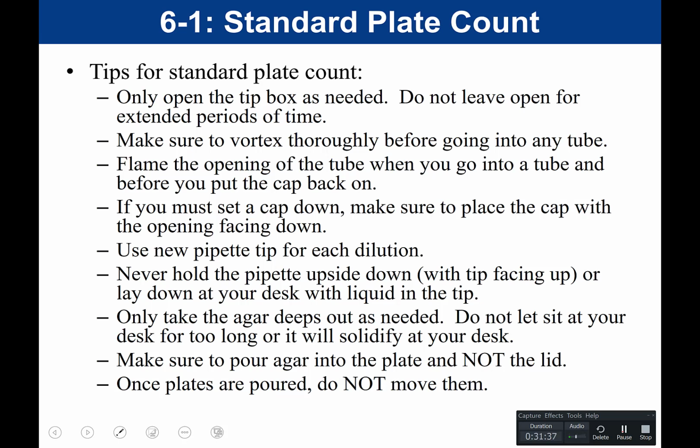You would use a new pipette tip for each dilution. Yes, you are transferring the same bacteria from one tube to the next. However, it's a better idea to get a new tip because sometimes you'll have residual liquid in the tip, which then might affect your pipetting accuracy.